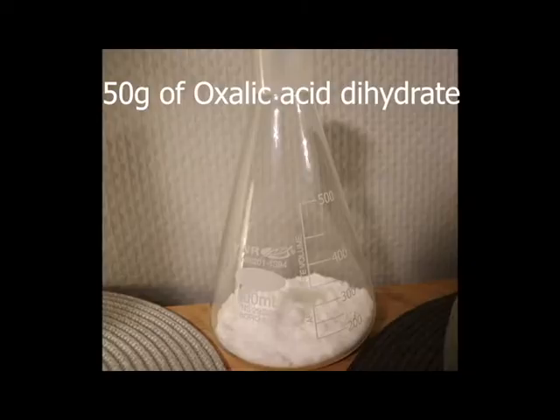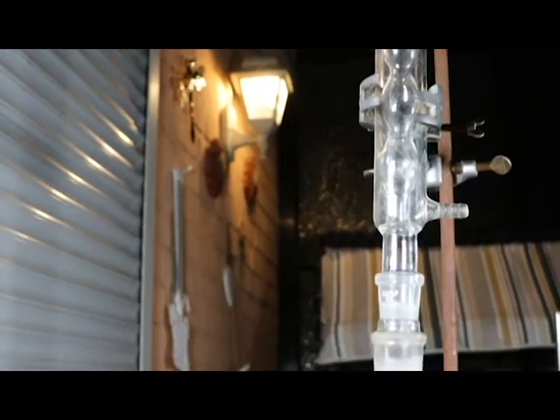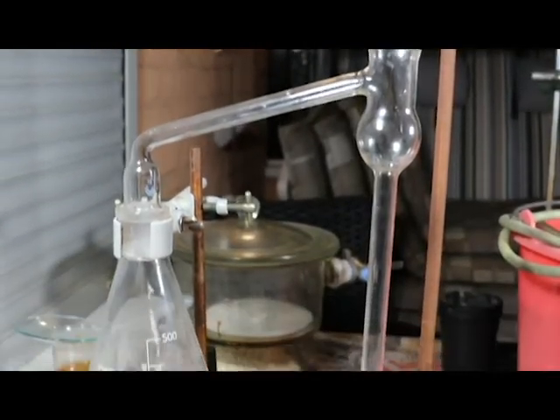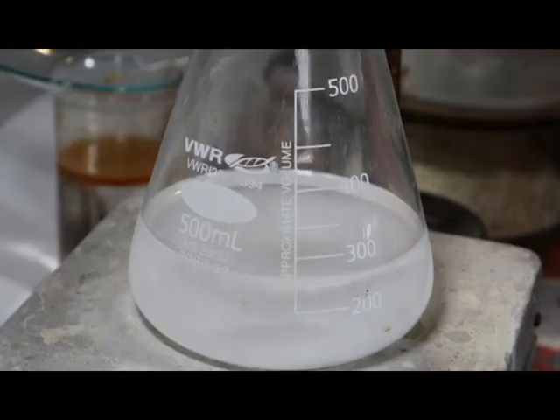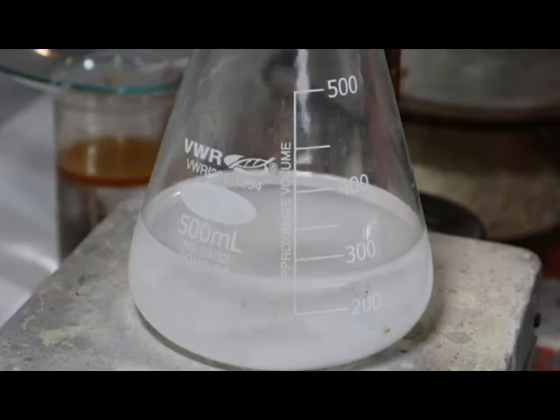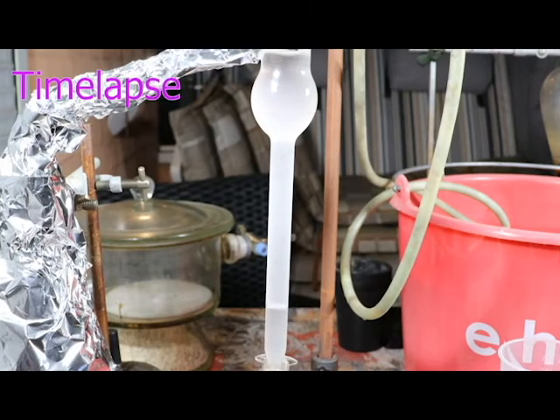We start with 50 grams of oxalic acid dihydrate in a flask. We then add about 200 milliliters of toluene to the flask and set up our Dean Stark apparatus with a reflux condenser. We then start heating our mixture until it starts to boil. As you can see, on the bottom layer, water is collected while the toluene is in the upper organic layer and flows back into the boiling flask. I let this reflux for about 2.5 hours until no more water would collect on the bottom layer.